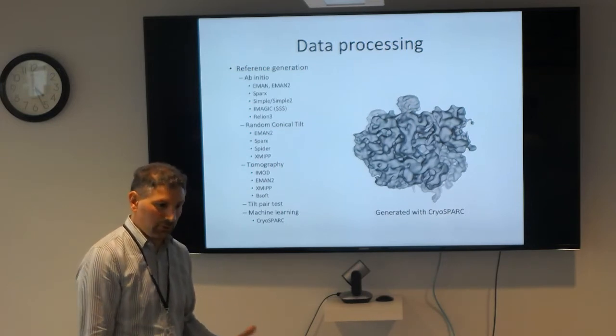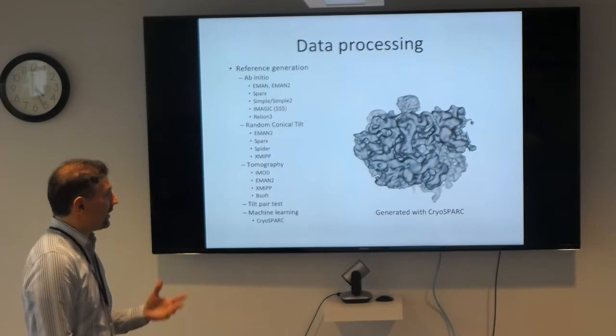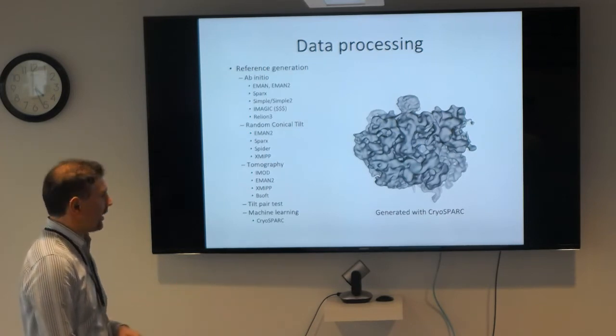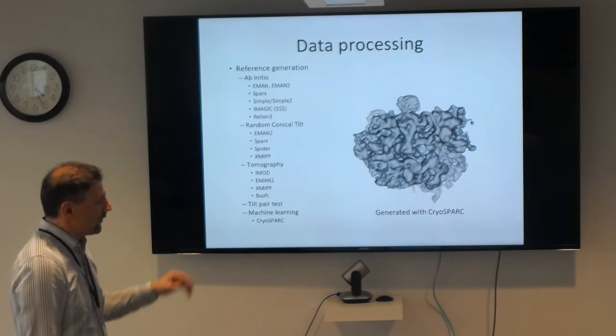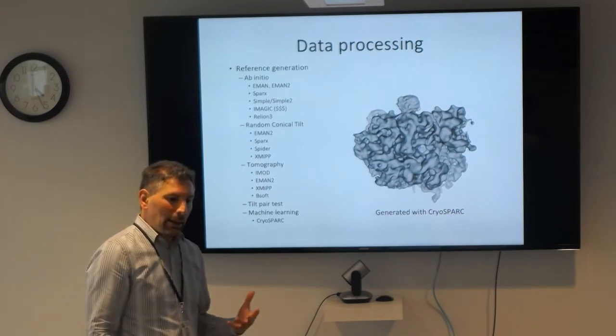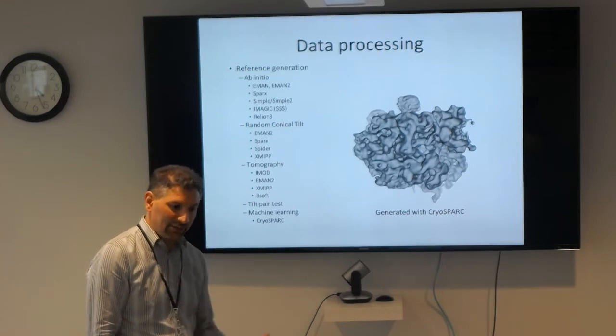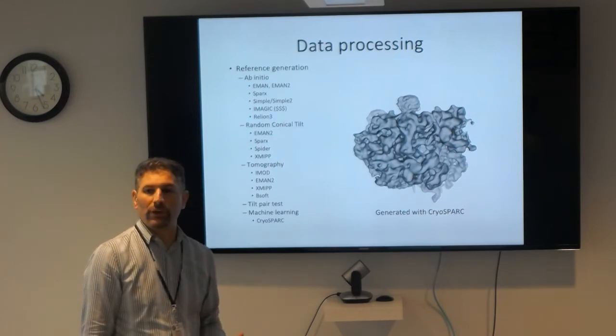Okay, that's when it matures really. A technique is really matured and it's really accessible to everybody. And not all techniques are like that. So tomography is a little bit different in the sense that the learning curve is a little different because it's not as automated. You really have to know what's going on.